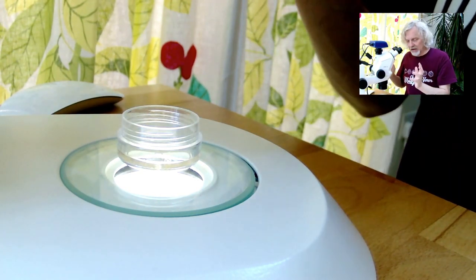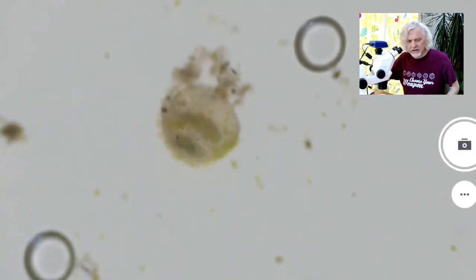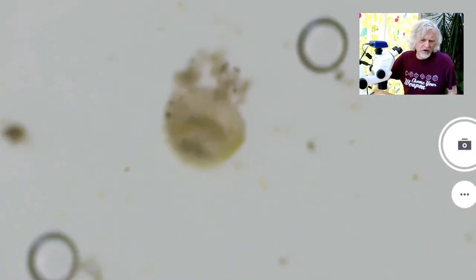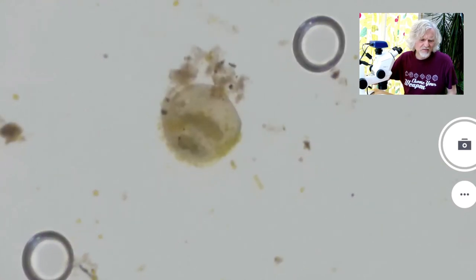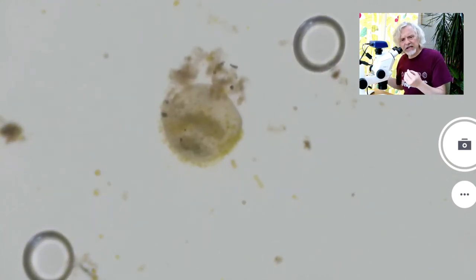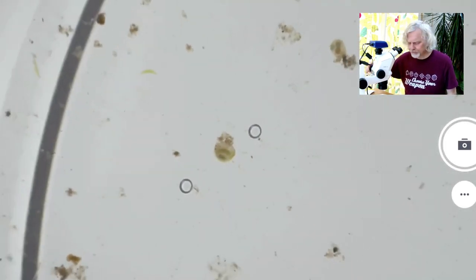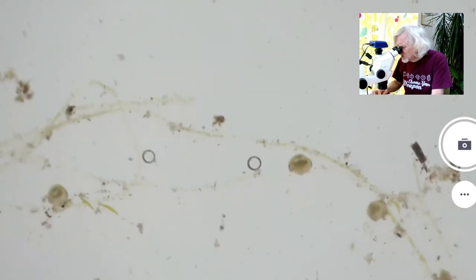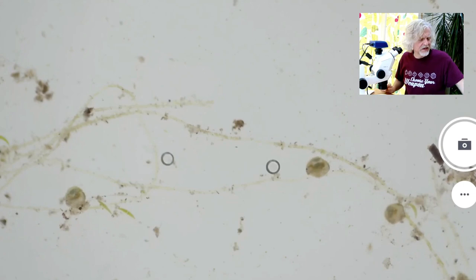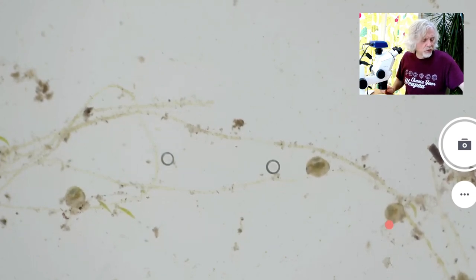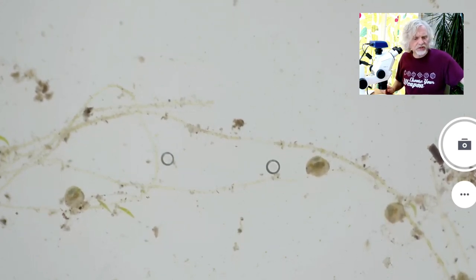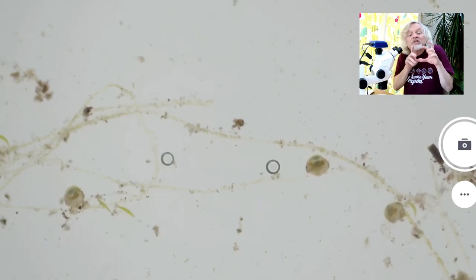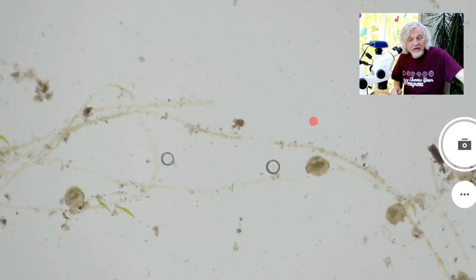So if I go back to my seed shrimp, that's kind of good for some things. But actually, you can see different details and often case more detail if we use a different sort of illumination. And what I'm going to do is I'm going to find myself a good section where there's a few. See, here's a few. There's a piece of pond weed there, sort of pond algae. Can you see this long stringy thing? And there's loads of them. There's one there. There's one there. Loads of these little ostracods. And they're all munching away on stuff that's along the length of this piece of algae.